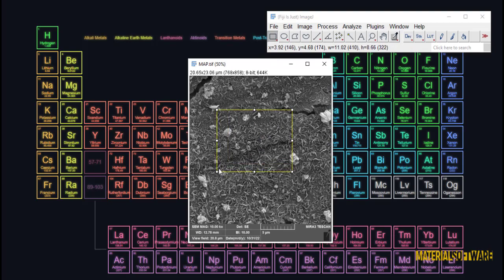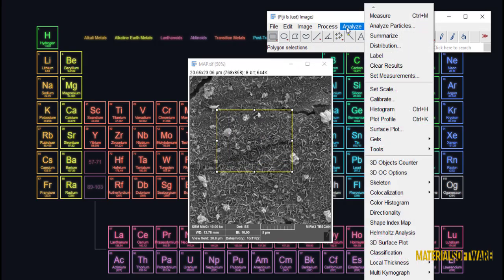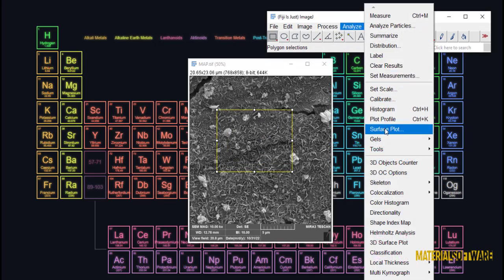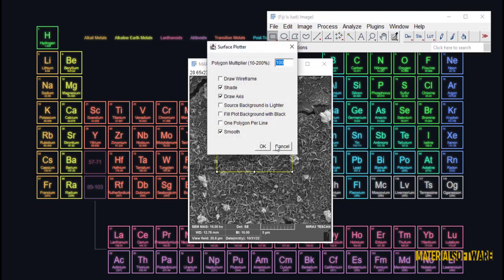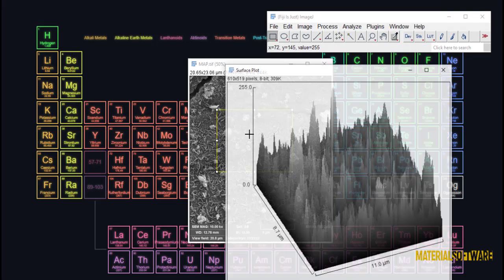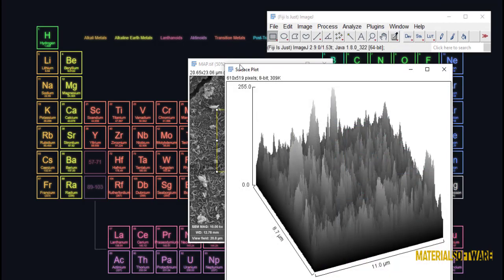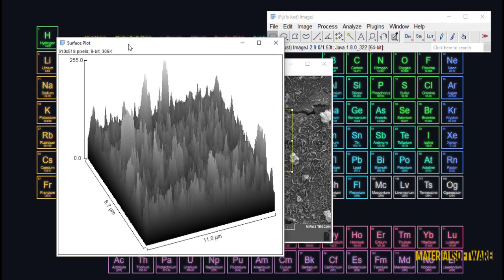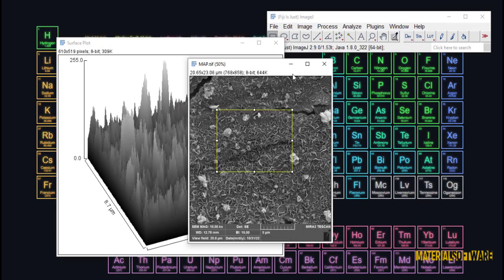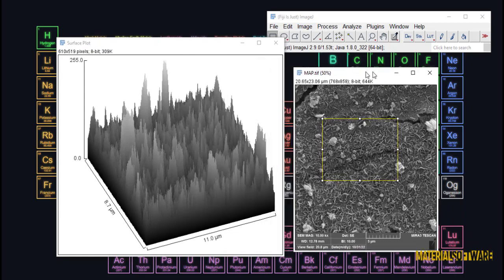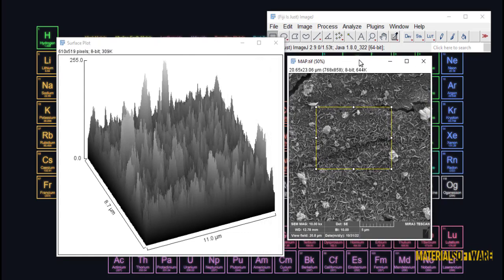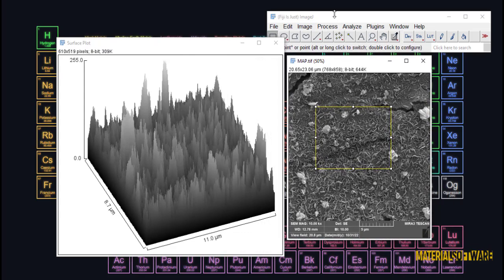It is not possible to check roughness in SEM images accurately because they don't give us much information about the third dimension. If you want to check roughness accurately, you should use AFM.